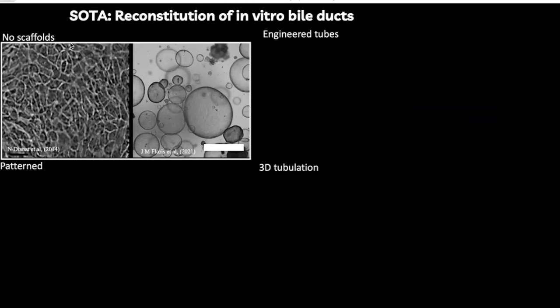Starting from very simple 2D culture, where you start with hepatoblasts that you either collected directly or derived from definitive endoderm, you can culture them in 2D, and then you get a beautiful epithelial monolayer, but then, of course, they don't form tubes. Now, if you take these cholangiocytes, when they are differentiated, and you place them into Matrigel or any other kind of 3D matrix, they form these beautiful cysts, which are monolayers of epithelial cholangiocytes forming this big balloon.